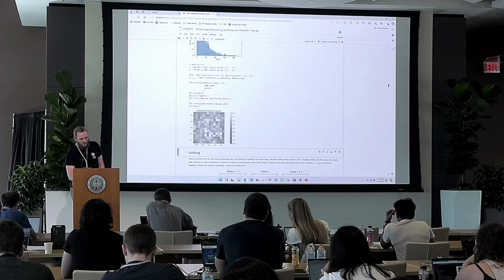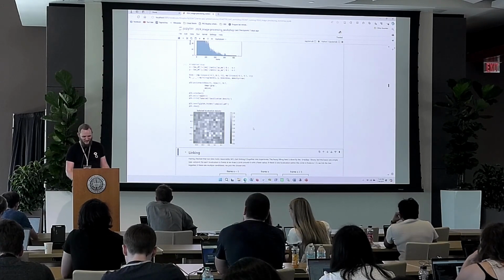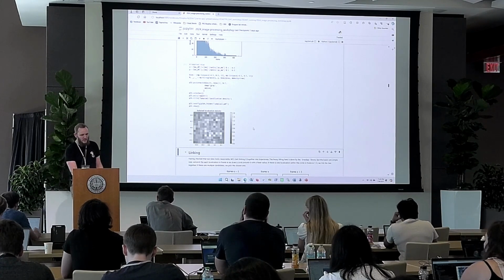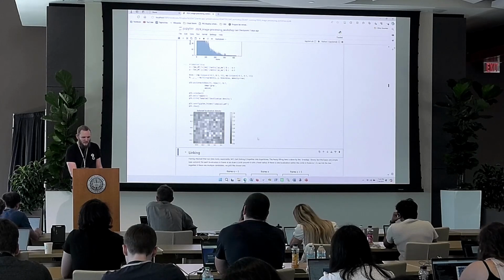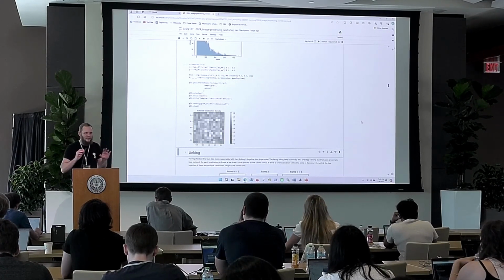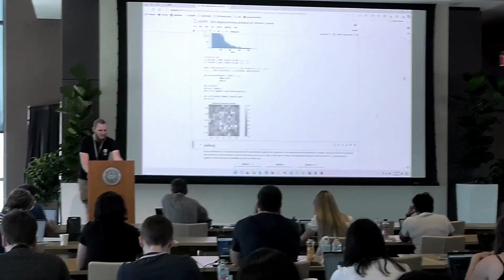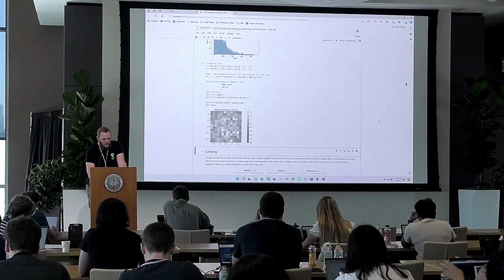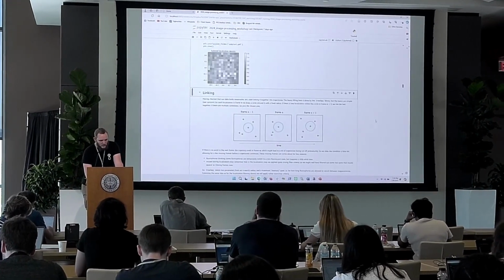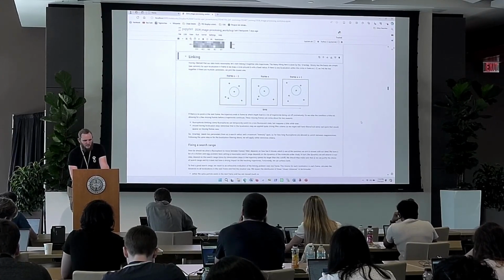And the histogram you get here, you can think of this as basically one pixel with all the post-decimal point things of all the localizations histogrammed over it, and we see that this is basically uniform. There's a bunch of noise, that's fine, but there's no discernible pattern in here, which means that we can at least reasonably trust this subpixel localization. There's nothing obvious going on. Once we've convinced ourselves that our data set is not obviously wrong, let's get into actual linking.